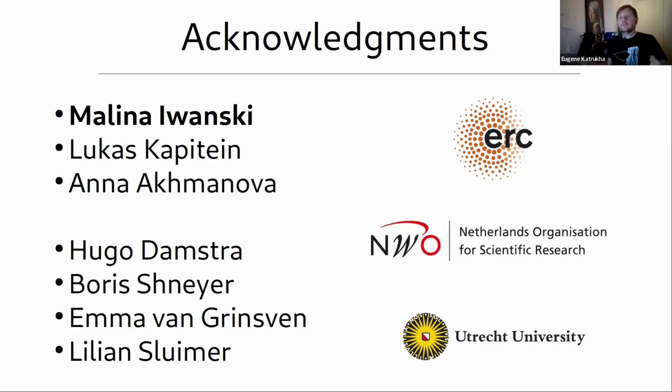Yeah, but it's a Fiji plugin, right? So you can just install it on the same PC where you have your Zen, and there's no limit in the licenses and things like that. And I think we use it. We are an imaging facility, right? And on almost all our PCs, together with the manufacturer software, we also usually have Fiji, for a quick look.